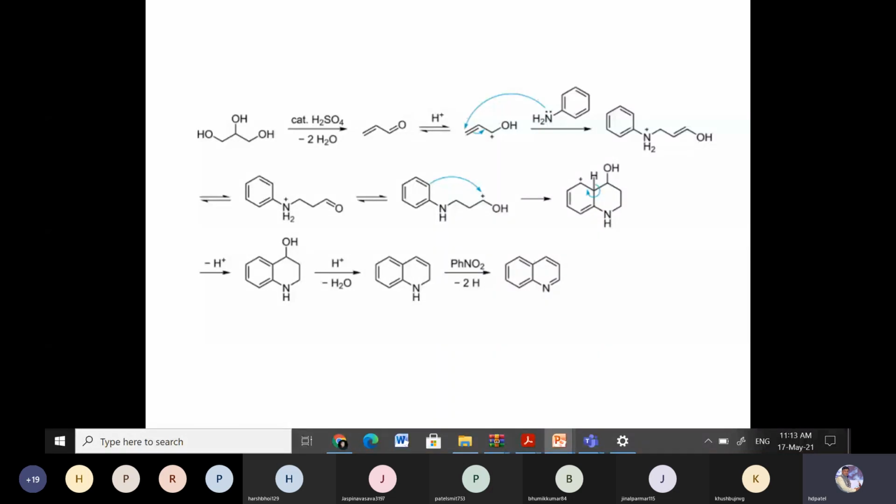Other methods are also available, known as the extraction method, that is, solvent extraction, by which we can separate or purify this compound. So there are different types of methods available, but the easiest is the zinc salt or zinc complex formation method, after which we can separate out the product. Here I have mentioned various methods, but I have explained the easiest method, which is applicable and can be carried out in our lab. Some other methods are also available, but I am not going to discuss all methods of purification.